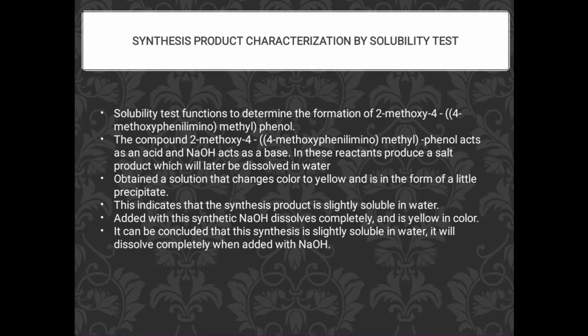This indicates that the synthesis product is slightly soluble in water. When added with NaOH, it dissolves completely and is yellow in color. Okay, it can be concluded that the synthesis product is slightly soluble in water. It will dissolve completely when added with NaOH.